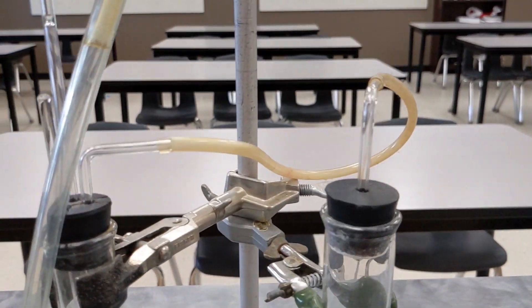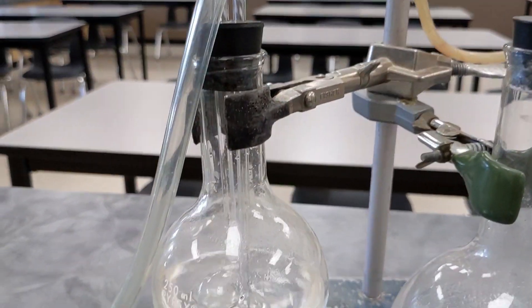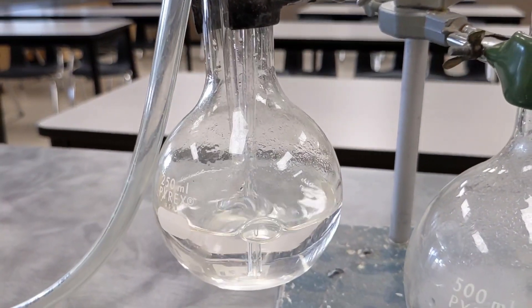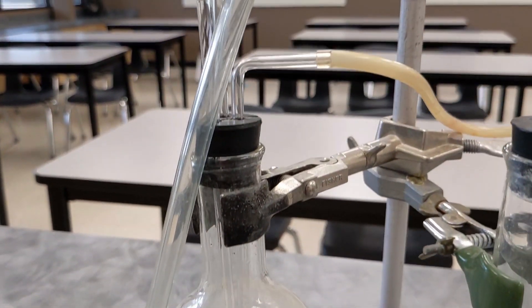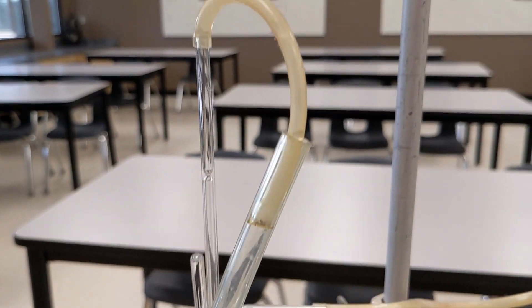The hydrogen is produced in this larger flask, travels through this tubing into the smaller one. Here, I'm going to bubble the gas through water — that's going to help remove some of the acidic vapors that are produced along with the hydrogen.